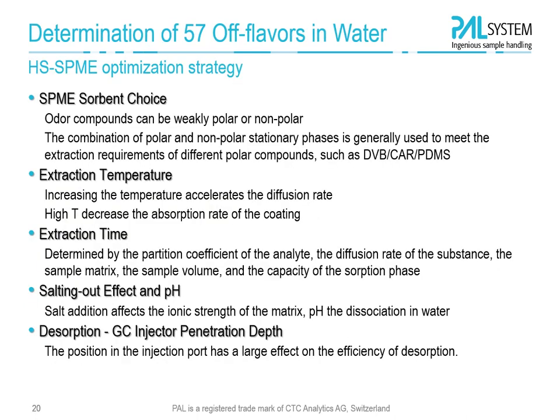We now take a closer look into a real-life experiment for the optimization of the SPME analysis for off-flavor compounds from water. Important for sure is the choice of sorbent phase. Here we used a triple phase of DVB, carbon, and PDMS for the wide range of compounds which have a very different chemical nature.